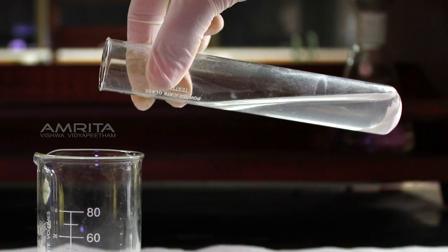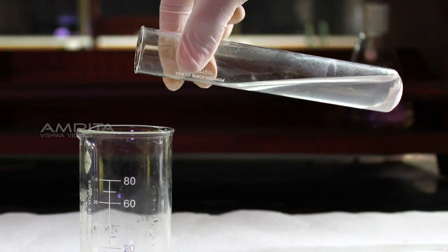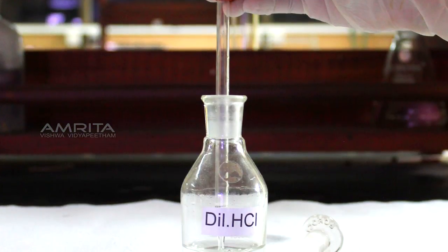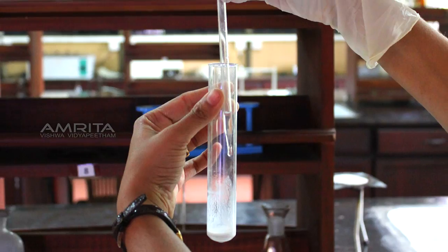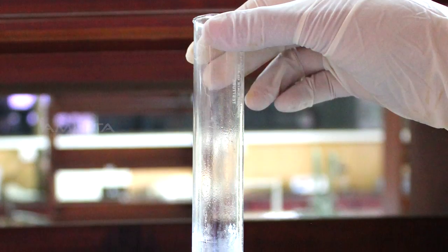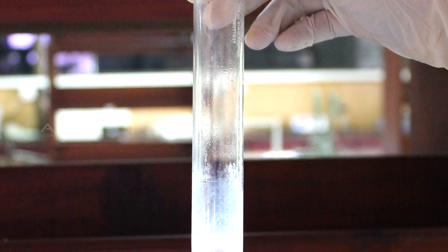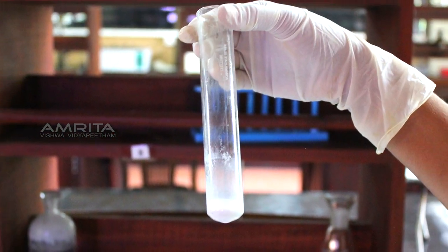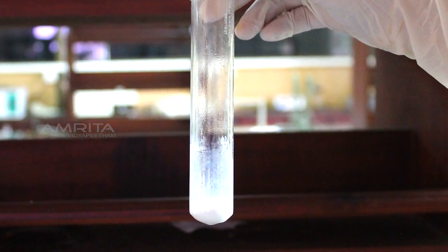Decant the upper solution in the boiling tube into the beaker. Add a few drops of dilute HCl to the white precipitate of barium sulphate and shake the test tube well. You can observe that the white precipitate remains insoluble in the dilute HCl.